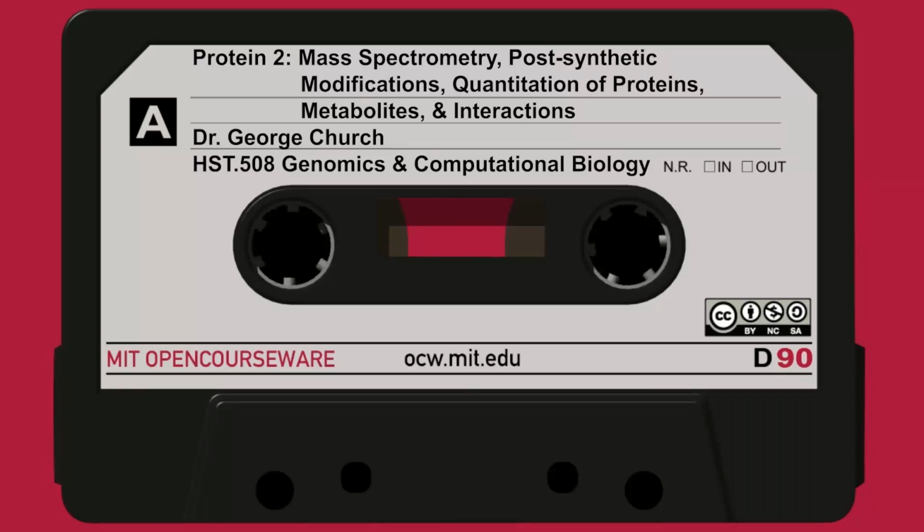We will make an analogy to the RNA quantitation methods, which I believe we had something very similar to on the left-hand side of slide 31 here when we talked about RNAs, all the ways we could quantitate them. A subset of these have an analog in the protein domain on the right-hand side of the slide. So, for example, one of our favorite methods that we used was microarrays. That's the top line of the RNA. This is where you would have the gene segments, either oligonucleotides or cDNAs, immobilized on a microarray, fluorescently label your RNA and quantitate. For proteins, the equivalent would be an antibody array aimed at unique features of each protein.